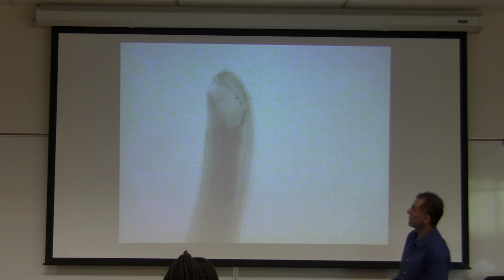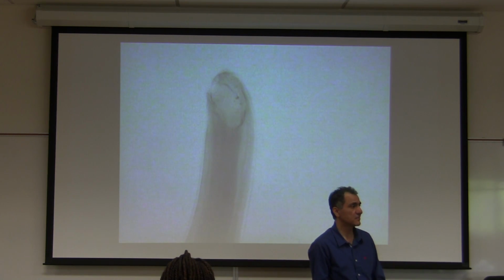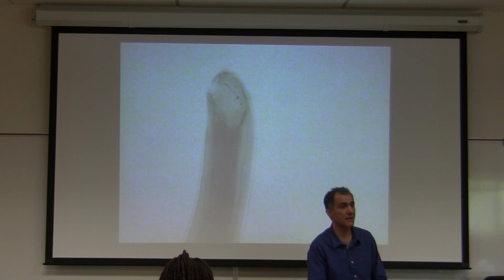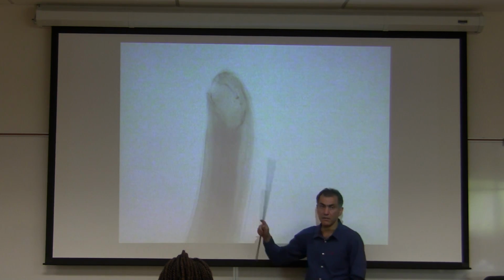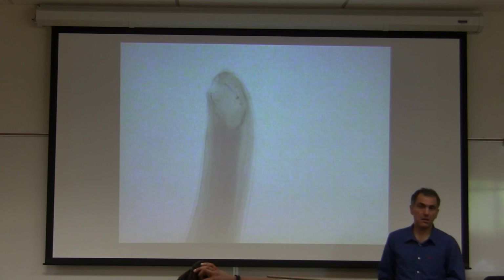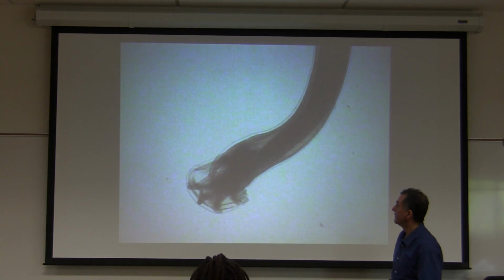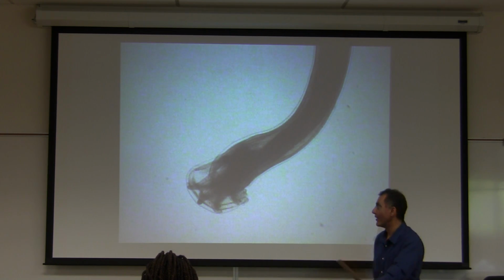Okay, what is the name of the organism? Ancylostoma caninum, Ancylostoma duodenale, Necator americanus. For the purpose of this class, you don't have to tell them apart. You look at the mouth part, you can tell them apart, but not for this class. What is a common name? Hookworm. Determine the gender. Can't tell. It could be male, it could be female. Will you ask that? No, I don't. Sometimes I throw a curveball.